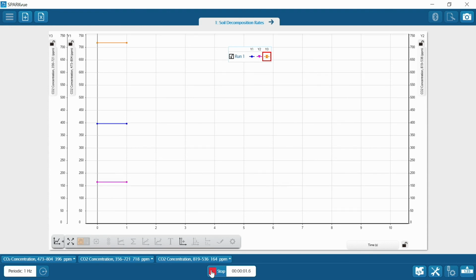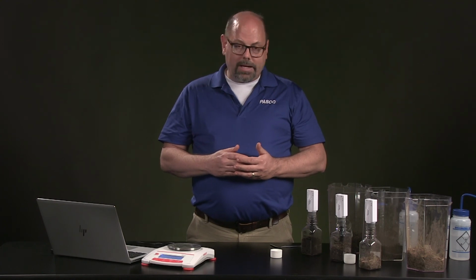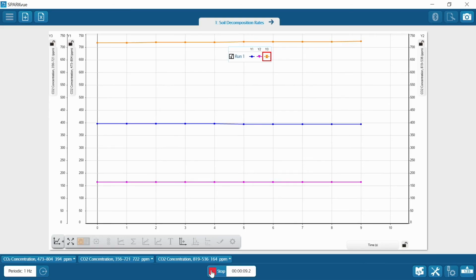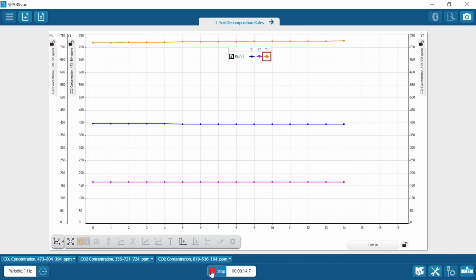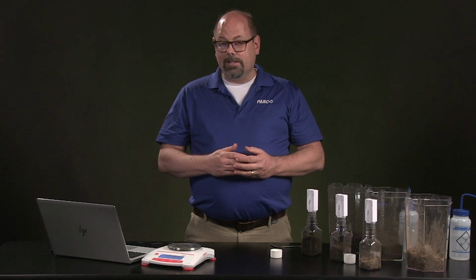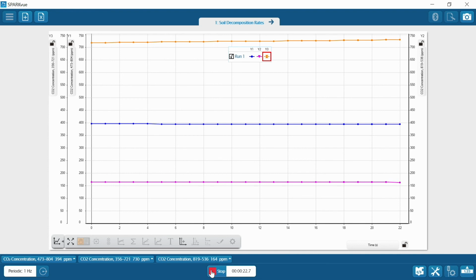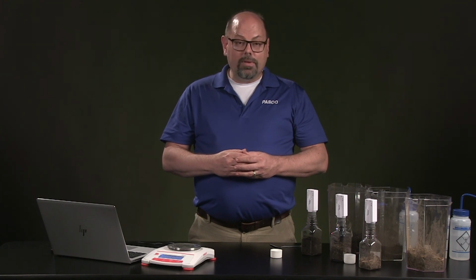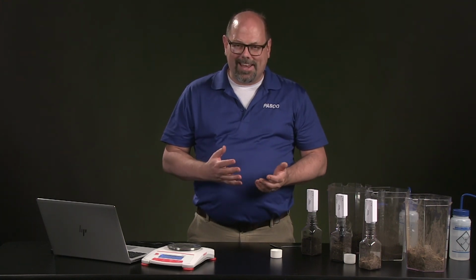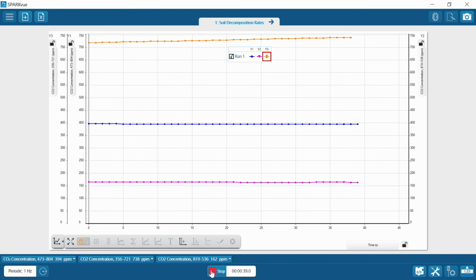We're just going to run it for about 3 minutes to make sure that we get plenty of data so that we see a trend. Sometimes right away at the beginning, it may not look like much. And as a matter of fact, you may be asking yourself, these are pretty flat. Should that be? Of course, that's a question for your analysis section, but it is encouraging to see that all three are doing the same, which is great. If nothing else, you're not quite sure why, but thinking about that as the data collection is happening is important.